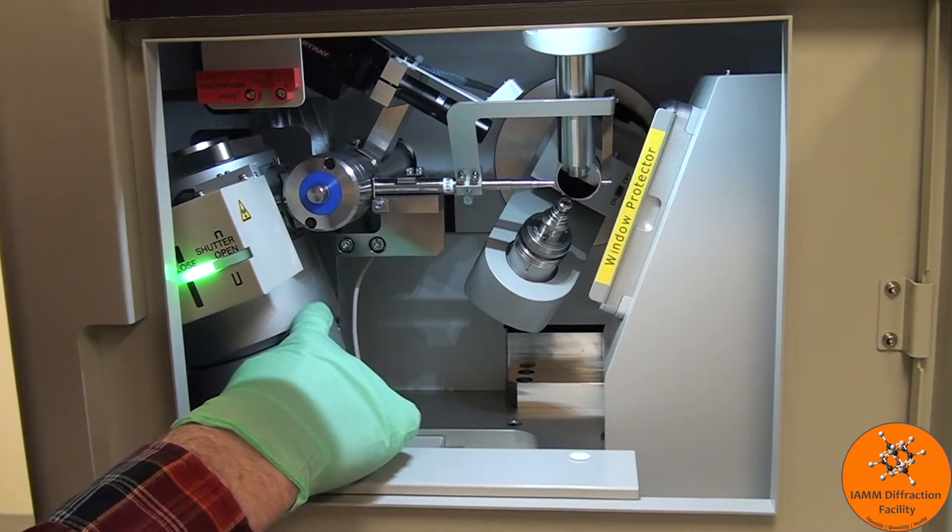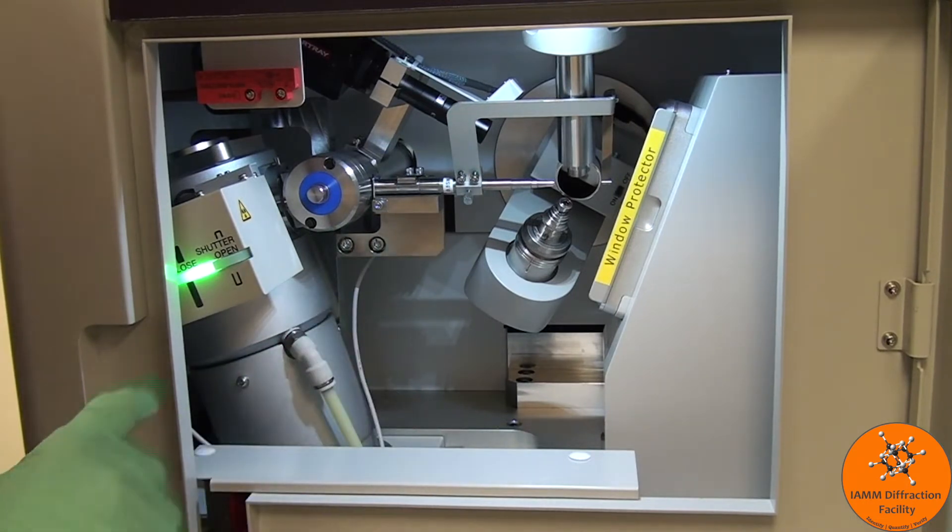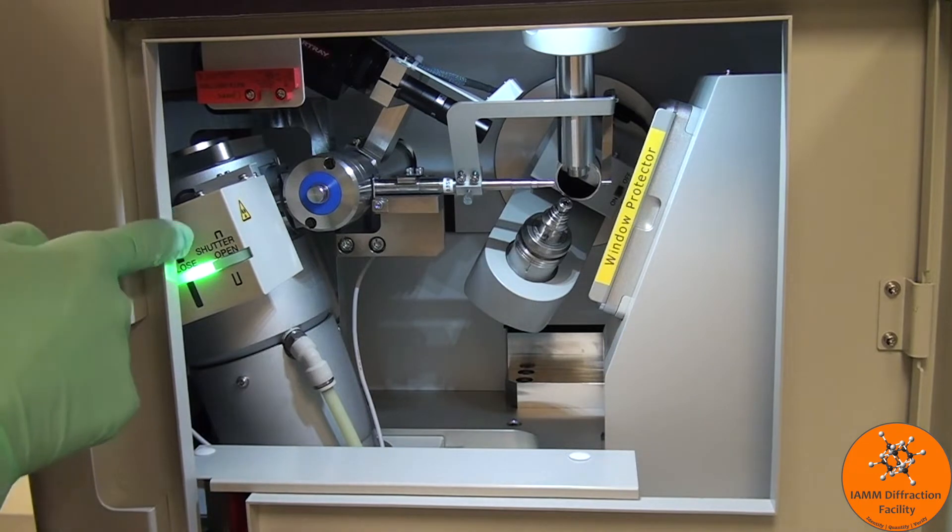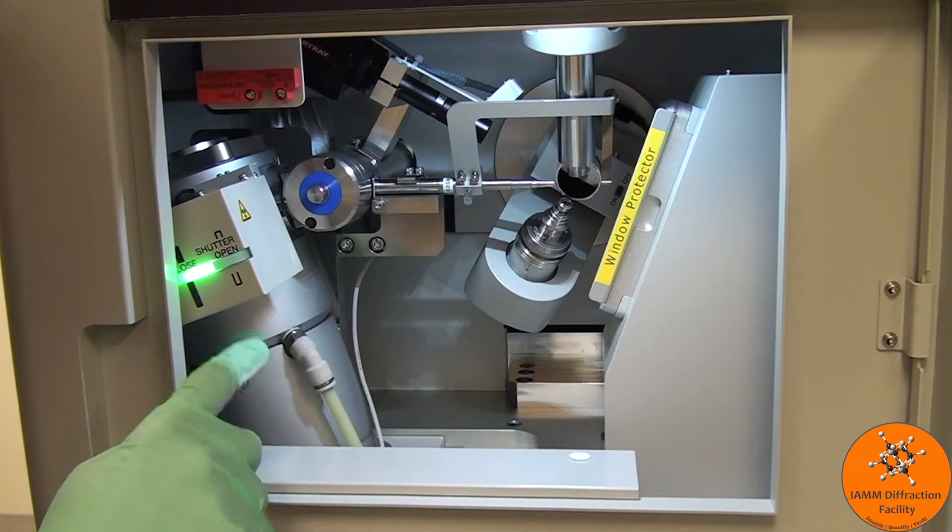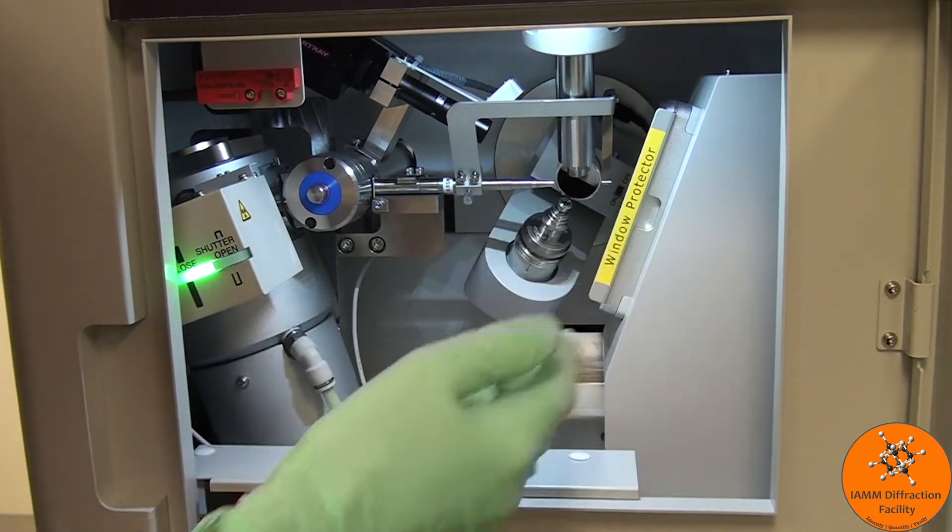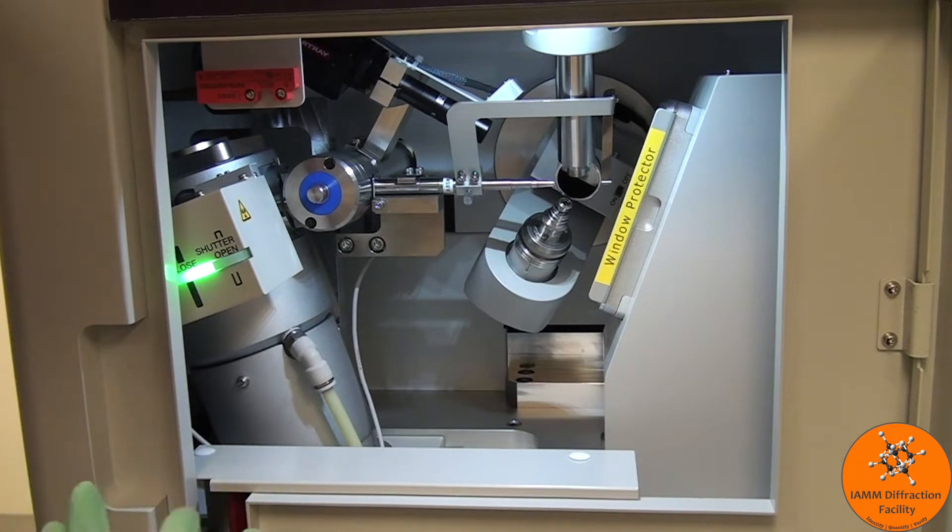On the left hand side, we have the x-ray tube. You can see here that it says shutter, so if this light is on, the shutter is closed and we can safely work inside. If this light is on, then the shutter is open and x-rays are flowing through the system, which means we do not want to be working inside.